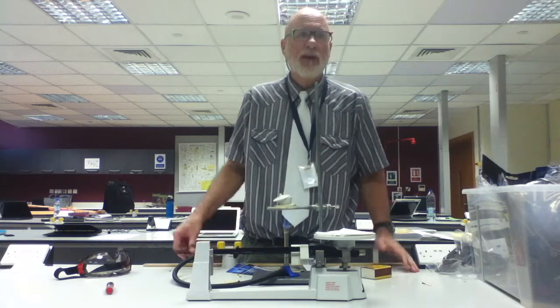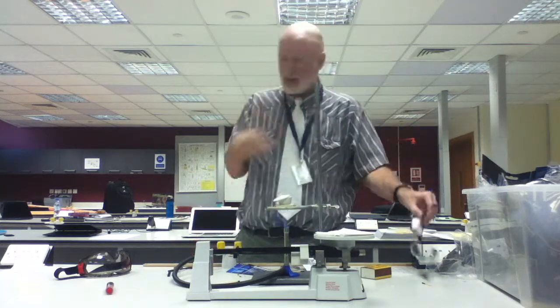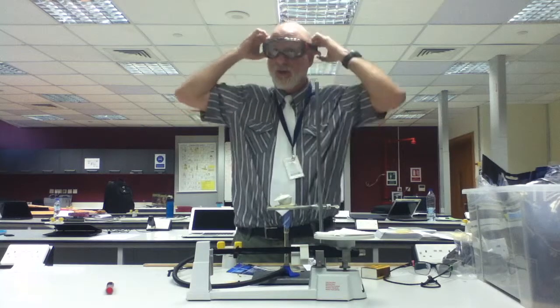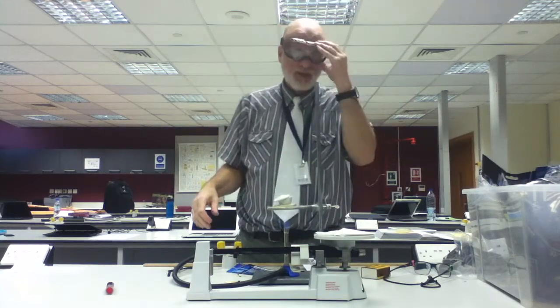What is it? My goggles have to be on. That's very good. Excellent, Sultan. What else? What else did I do wrong? What else did I do wrong?